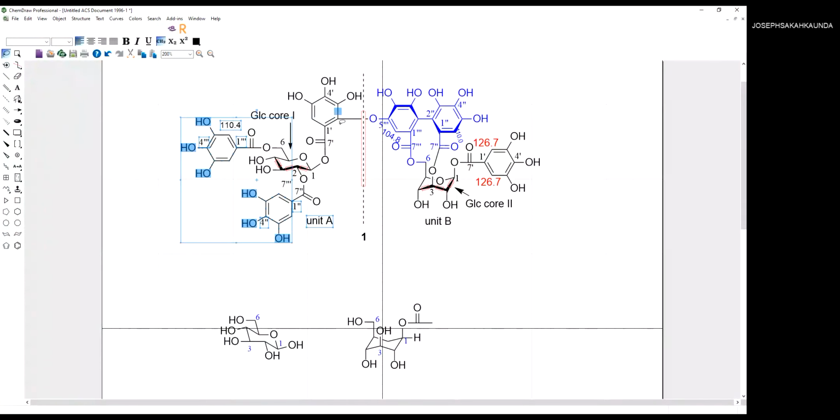Yes. This carbon is quite larger. Meaning, I mean, it suggested, let me not say meaning, let me use the right chemistry language. It suggested that there is a link because this is a known compound.